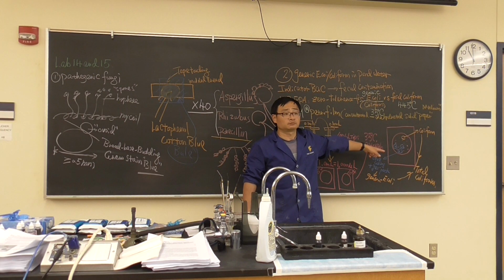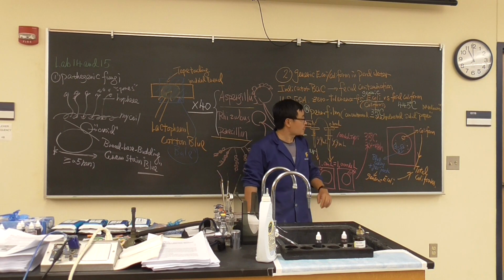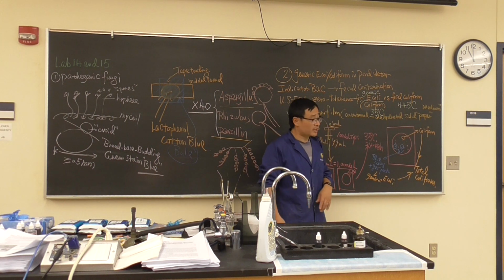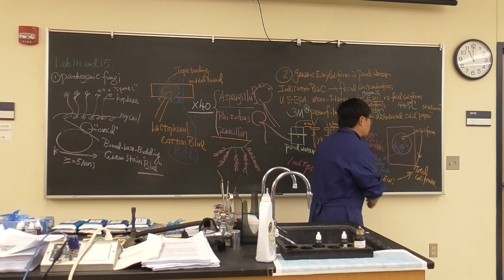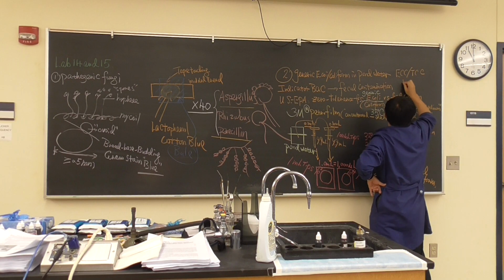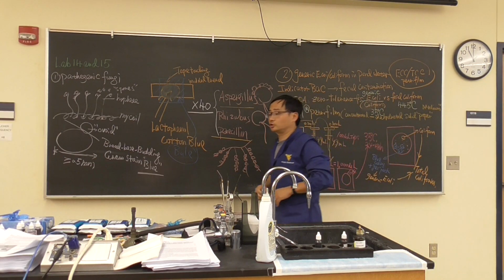There are 2 different types of colony. Well, maybe only one. It depends. You see only those red dots there, that's coliform. And you will see some gas bubble packed blue colony, it's generic E. coli. So what is total coliform? You need to add them together. So this one we sometimes call it ECC, TCC petrifilm. It's a very magic term. You can do it.